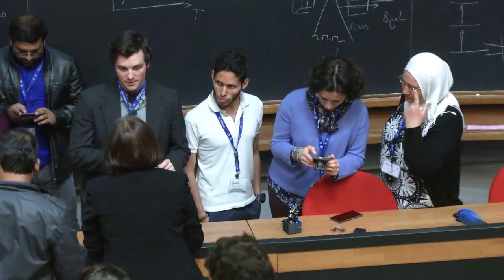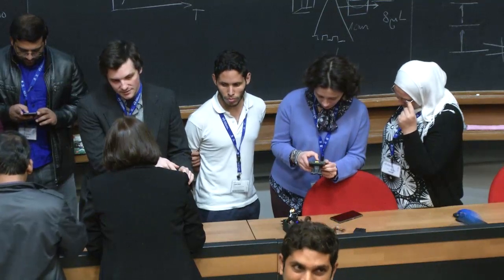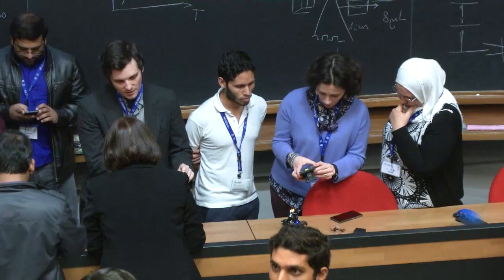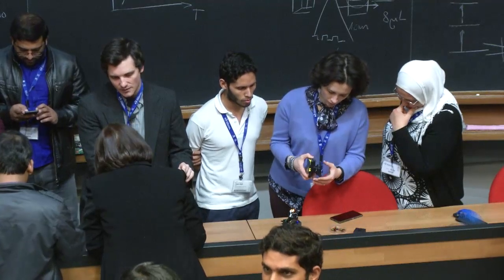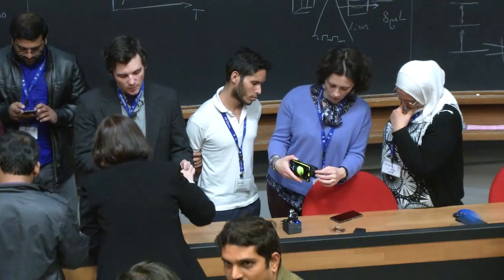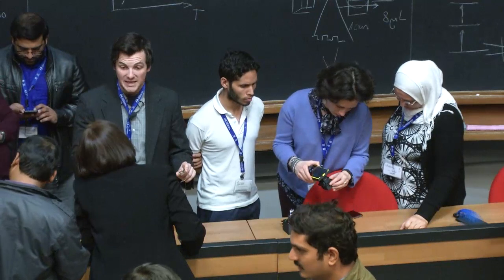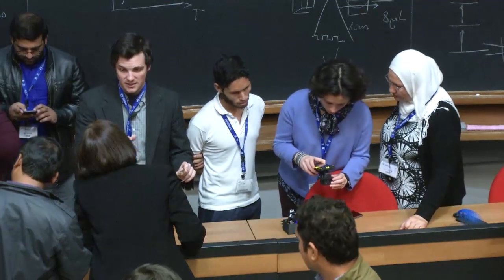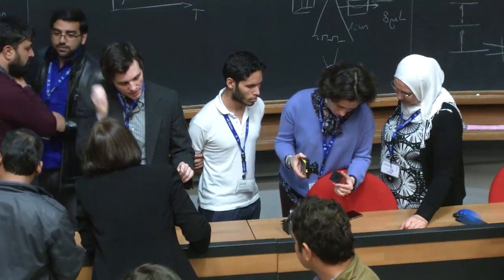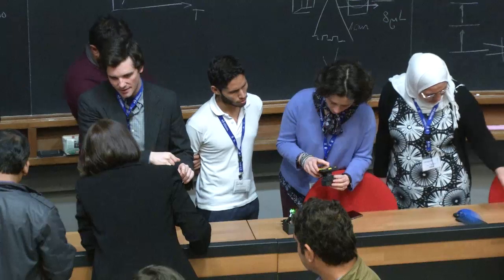They're all the same depth. So actually here, these three are line gratings. These two columns are hexagonal nanohole arrays, all of the same depth. The only thing that changes is the periodicity. But the aspect ratio is locked. It's the same. So the periodicity varies. We go from 500 to 600, 700, 800, 900 and 1,000.